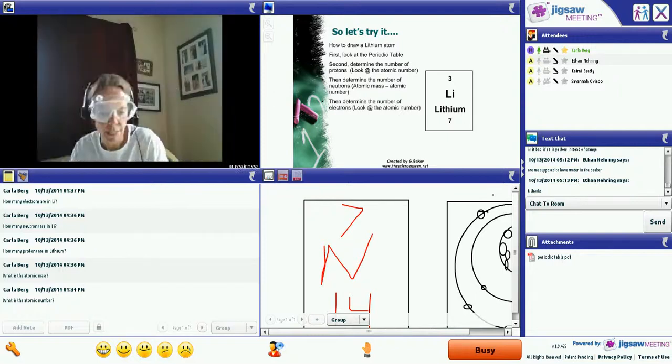And now it's been almost 5 minutes. I don't have anything really going on. I have some precipitate in mine, my column 12. But I'm going to let that sit for a minute, and we're going to look at the questions that have to do with Part A of this lab. Note I still have my lab goggles on because I do still have chemicals out in front of me.